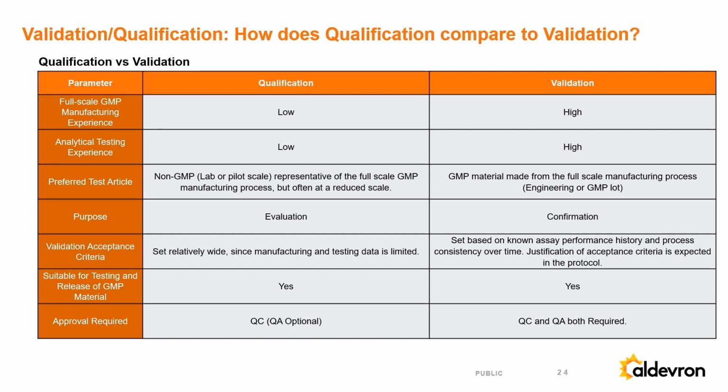And again, it's worth noting how qualification compares to validation. It's quite different, right? I think the challenge we have at Aldevron is that we have clients that span the range, from early phase to commercialization.